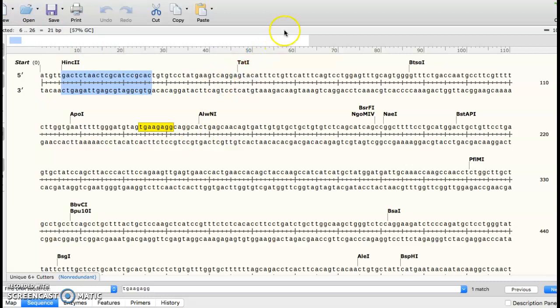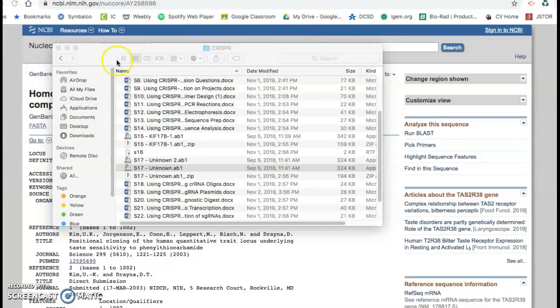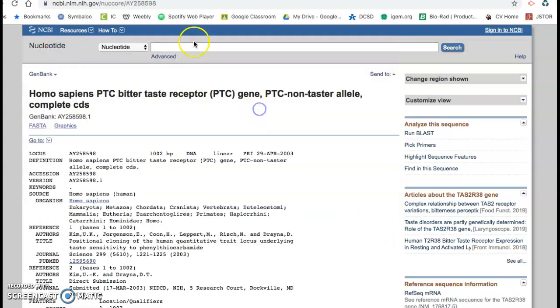And you can do this in a Word or a Google document also. I would just grab the first maybe 20 nucleotides, and then you're going to want to check, right? If SnapGene isn't on the computer, or you didn't have access to it, it's okay. That's still going to work, right? You're still functionally doing pretty much the same thing.